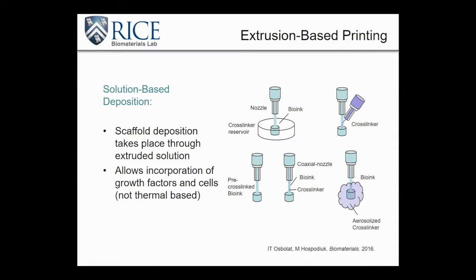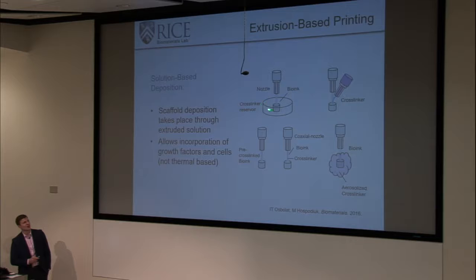And finally, with extrusion printing, we need to ensure that somehow the first layer is anchored onto our tissue culture dish. So for instance, I've had this happen time and time again, where when you print this first layer, let's go back to my alginate example, where somebody has a cross-linking reservoir of calcium chloride, and they're ready to start printing their alginate directly into that.